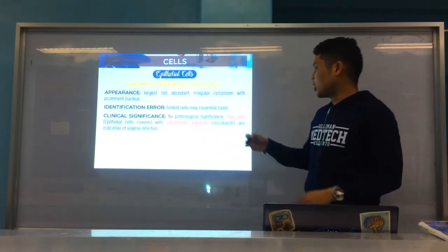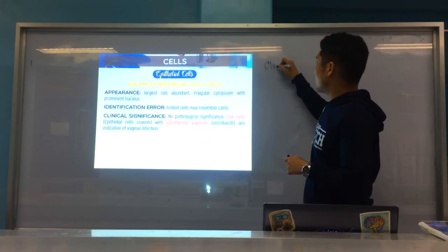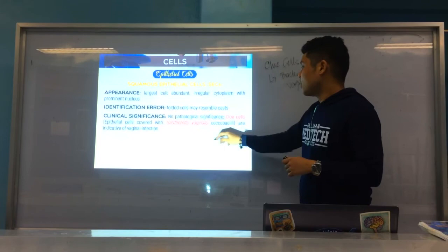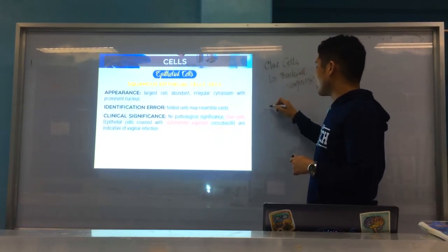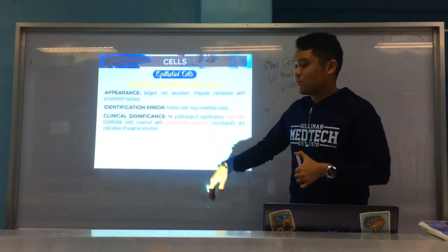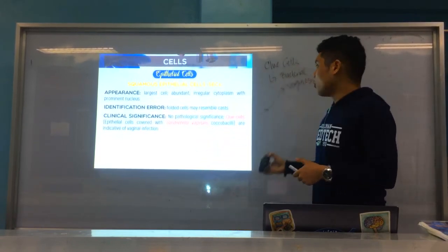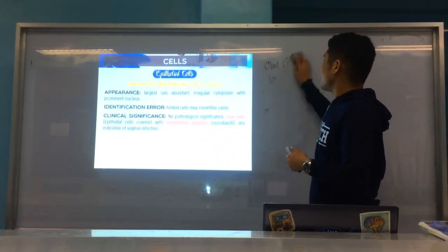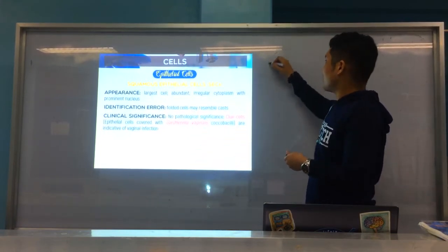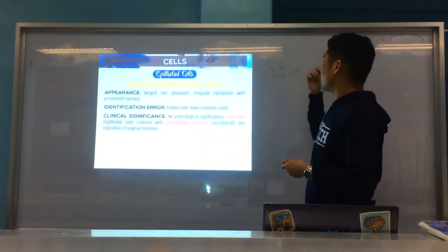Okay? Alright. Clinical significance: of course, squamous cells usually have no pathological significance. But we have these particular cells known as your clue cells. Clue cells are usually seen in bacterial vaginosis. Okay? Caused by what organism? Gardnerella vaginalis. It is the causative agent of bacterial vaginosis. Now what happens is, in clue cells, the epithelial cells are heavily laden. So for example, here is an epithelial cell. It looks like a sunny side up.